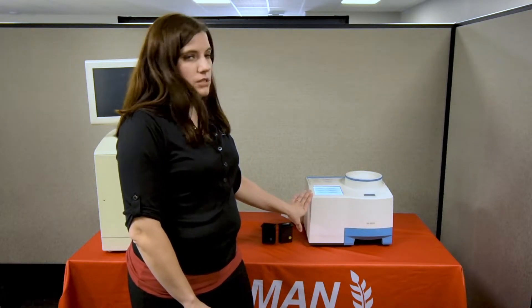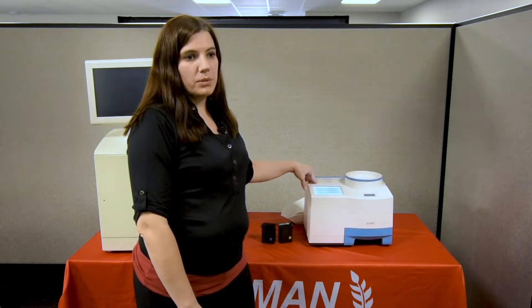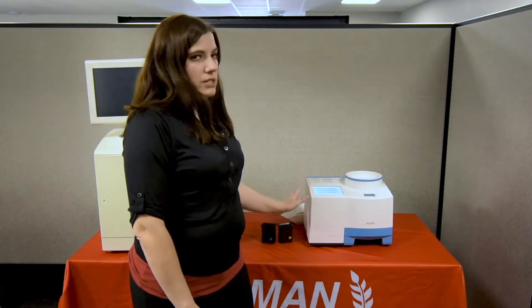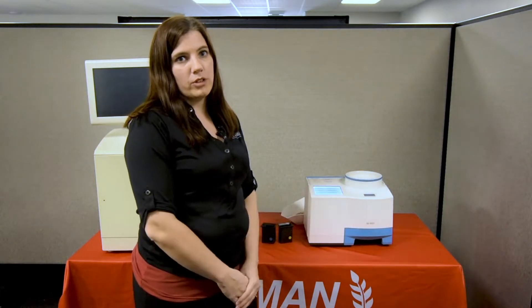I'll show you how this one is used. It's quite simple. It has a battery similar to a laptop so it's rechargeable, which makes it portable. You can take it into the field, bring it to your neighbor, wherever you would like to use it.